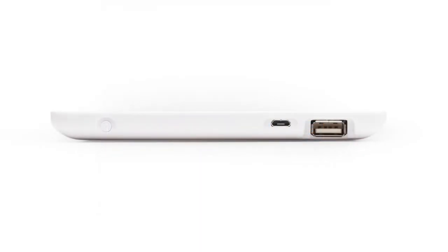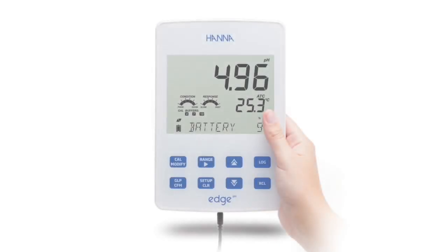Two USB ports are available on the meter. One standard USB port is for data export using a flash drive. The other is a micro USB port for charging the meter and PC connectivity. The meter may be used on or off the charging cradle and has a battery life of eight hours when continuously used.